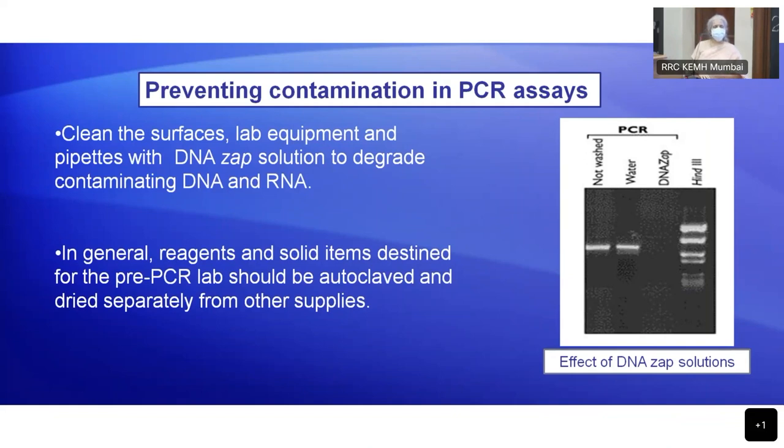So if you're working in the biosafety cabinet, which is a must, right, the surfaces of the biosafety cabinet should be wiped and cleaned. Not just with sodium hypochlorite, not just with alcohol, but also use a DNA decontamination solution at the end of the day. Okay?